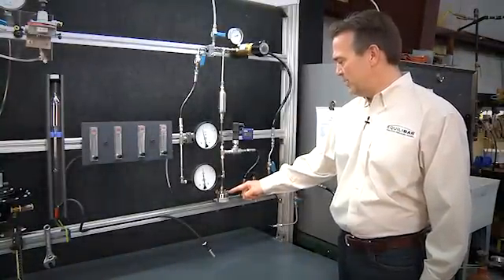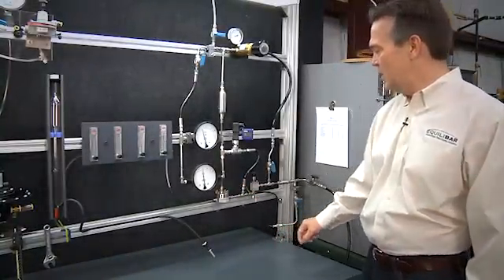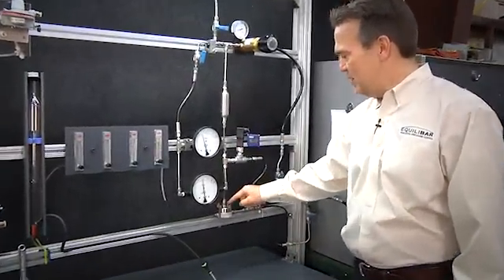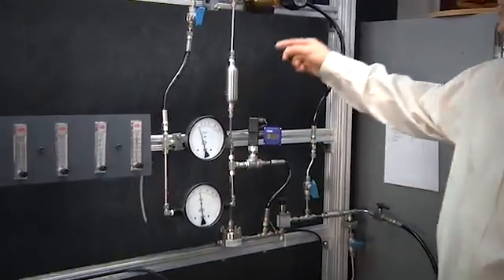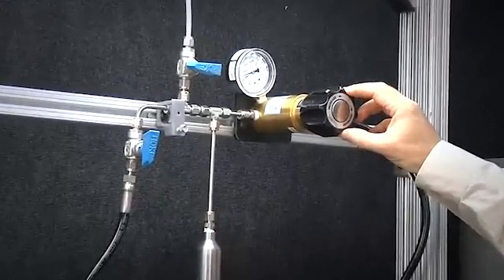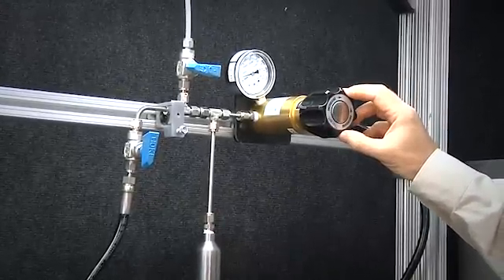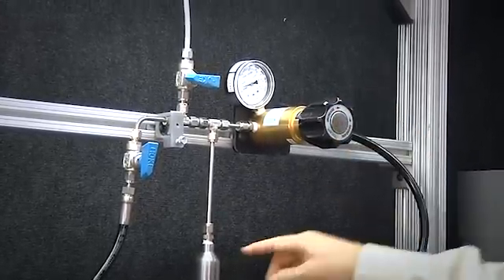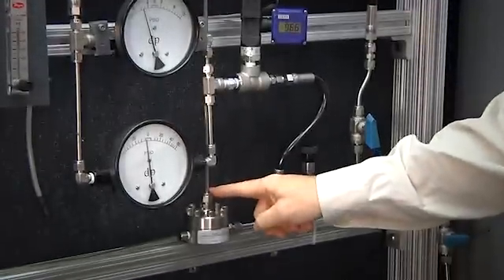Here we have an Equilibar back pressure regulator with a PTFE diaphragm. We are going to provide the set point to this back pressure regulator through this standard nitrogen pressure regulator here and we are applying about 960 psi to the set point pilot right now.